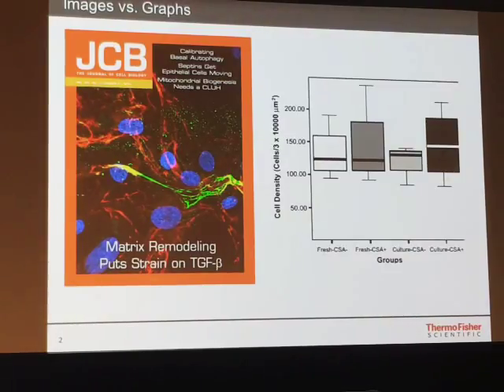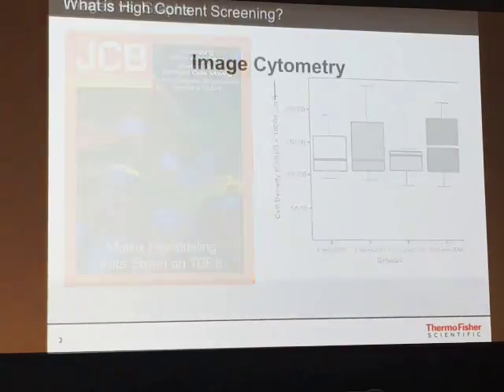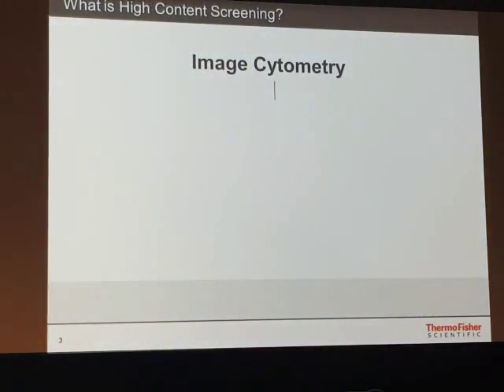What you have to keep in mind is that we can have all those nice images, but without the data that we can extract from the images, we cannot tell our story. We cannot convince someone that our research is really what we think it is and how we envision it. So at that time, if I would have known that there's a technology that can help me to extract those data from those images, I would have loved to take it. So that's why today I want to talk about image cytometry.